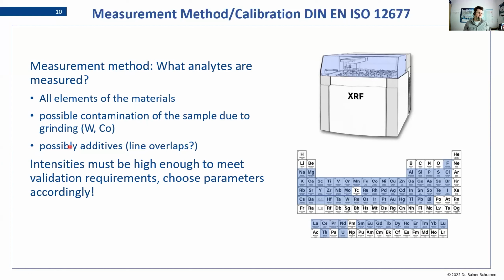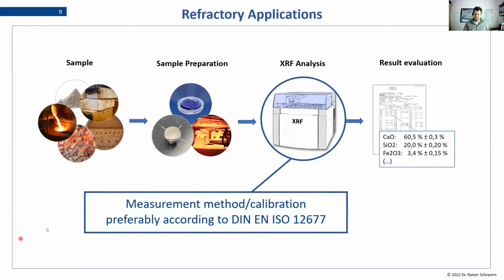There's this very prominent example of the bromine overlap on alumina. So obviously, if you're using lithium bromide as an additive, we would want to measure the bromine overlap as a correction on alumina, because in the alumina-rich materials, this is one of the main interests.